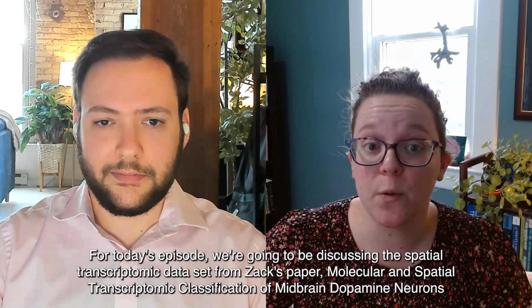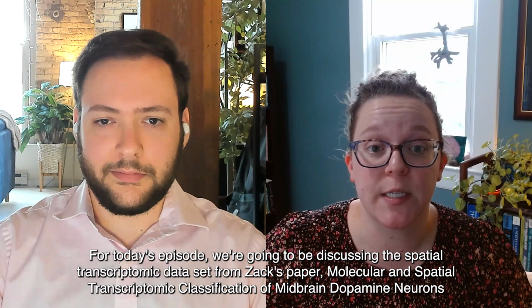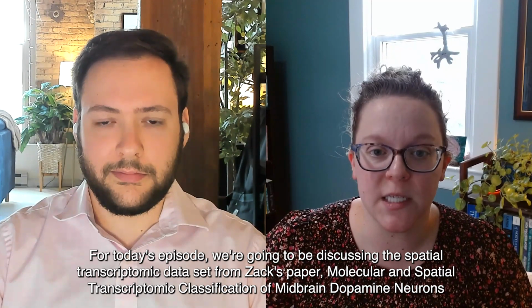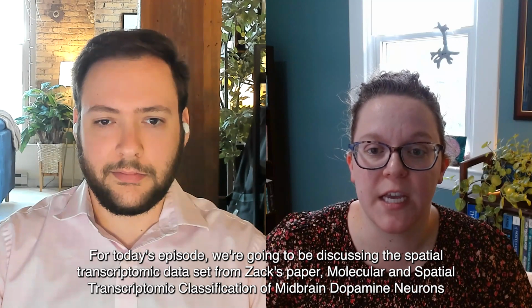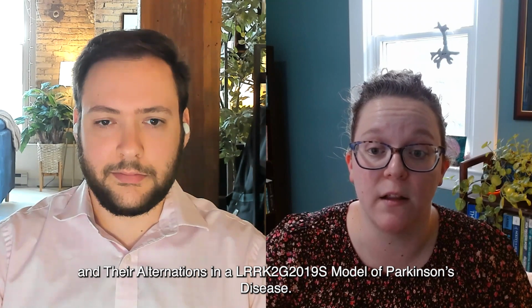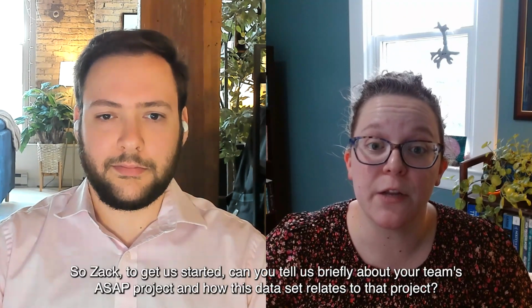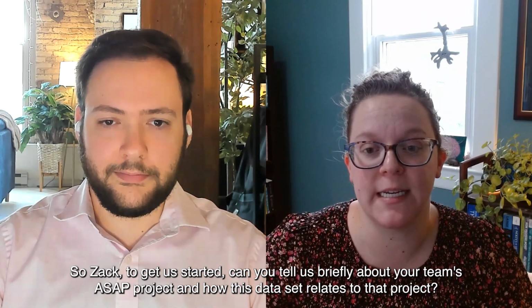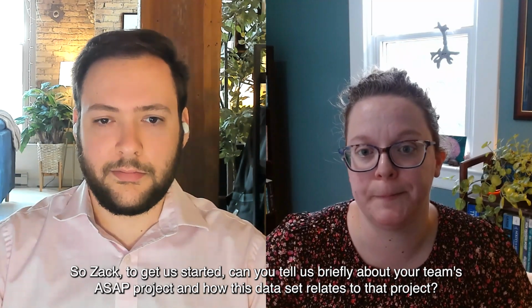For today's episode, we're going to be discussing the spatial transcriptomic dataset from Zack's paper, Molecular and Spatial Transcriptomic Classification of Midbrain Dopamine Neurons and their alterations in a LRRK2 G2019S model of Parkinson's disease. So Zack, to get us started, can you tell us briefly about your team's ASAP project and how this data set relates to that project?